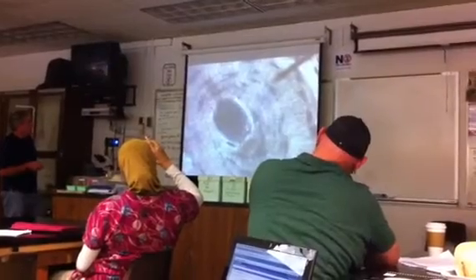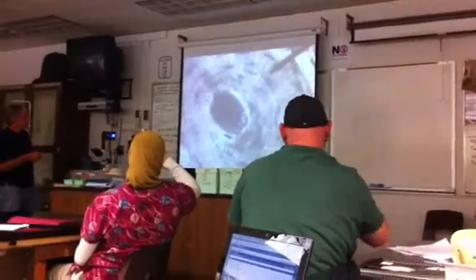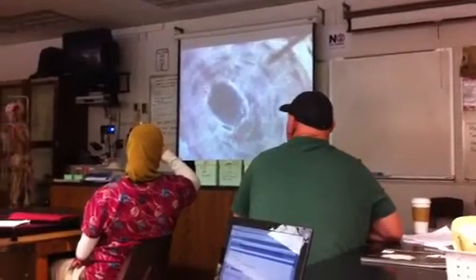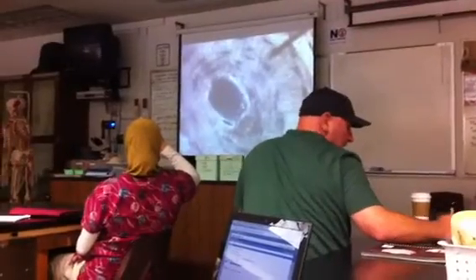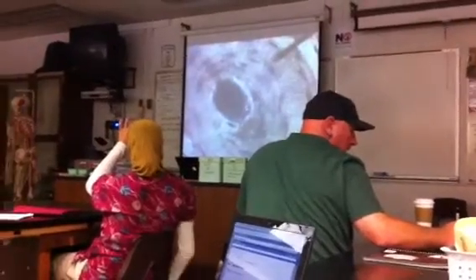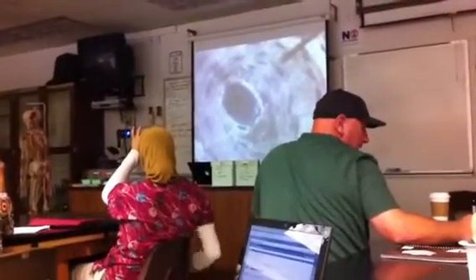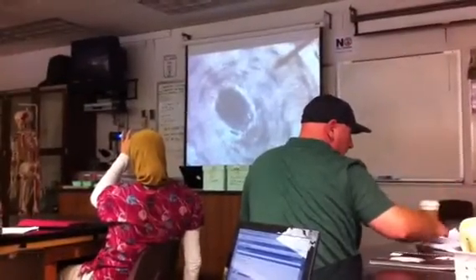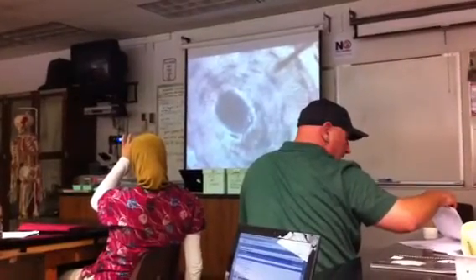Also, I know you can see these tiny little black lines that sort of look like little fractures. That's how I've described them in the past. Those are structures called canaliculi, the little canals that allow the nutrients delivered in the central canal to reach the osteocytes, because obviously bone is solid, and diffusion is not going to happen very well in a solid structure. The osteocytes are alive, of course, but they're trapped, they can't go anywhere. So these are the little canaliculi, the little canals.